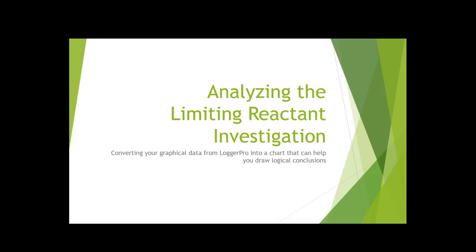This is a few slides to analyze the limiting reactant investigation that is done by recording pressures. We're going to convert your graphical data from LoggerPro into a chart that can help you draw logical conclusions about the stoichiometry of a chemical reaction.